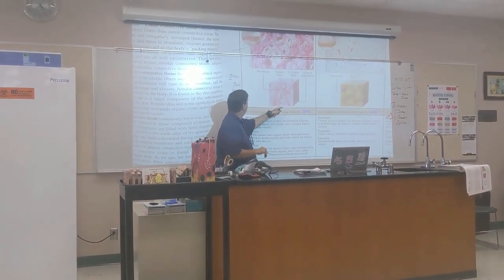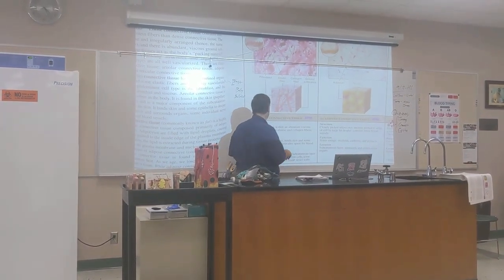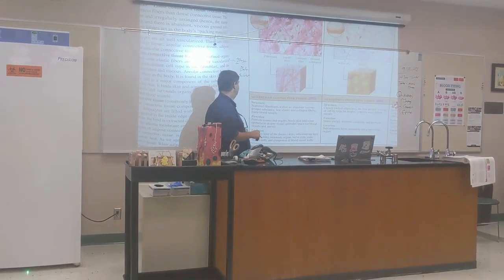And you can see we've got, both in the drawing and the picture, a whole bunch of those specialized cells, right? And what are they going to be doing? They're going to be making substances.